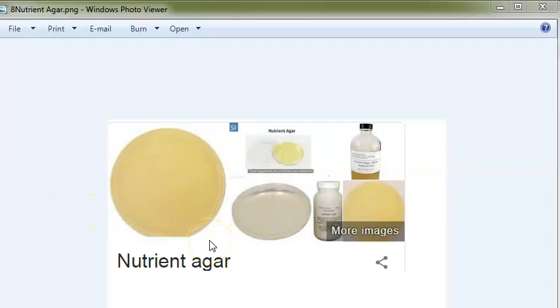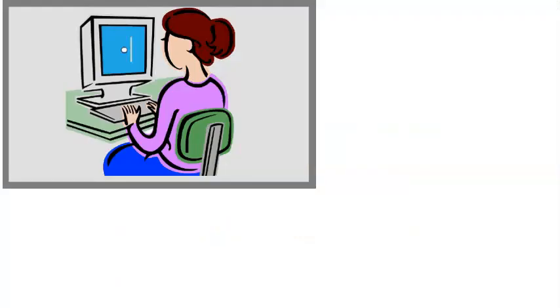On nutrient agar, if you put Staphylococcus aureus, you will get yellow colored colonies because of carotenoid pigment. Moving on to enriched media: blood agar and chocolate agar. Blood agar is used to show hemolytic properties of bacteria — for example, beta hemolysis in Streptococcus. Usually sheep or horse blood is used.